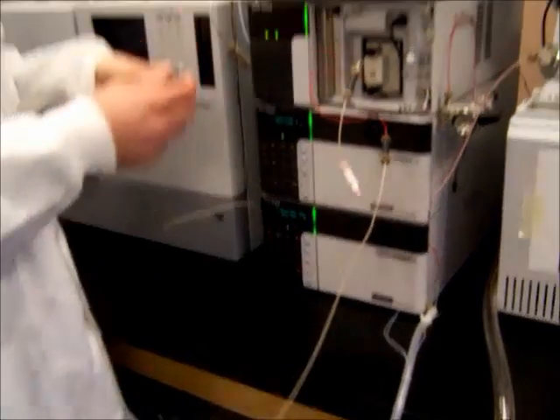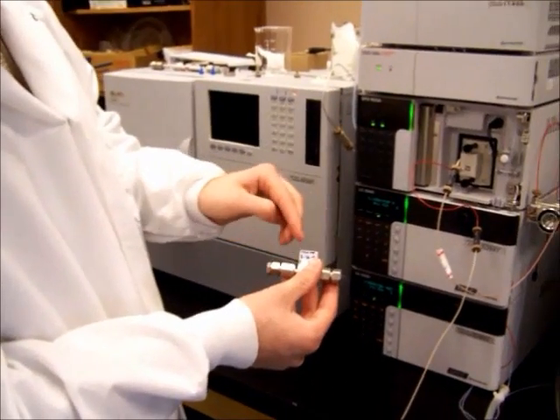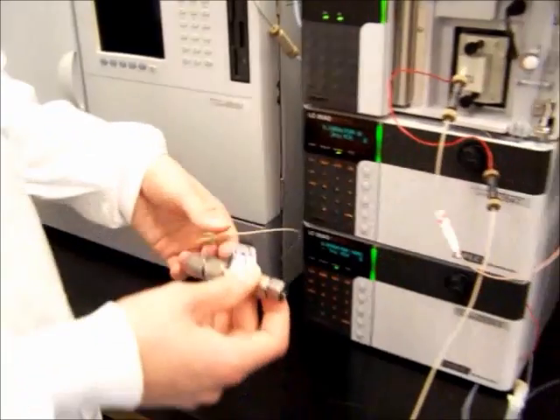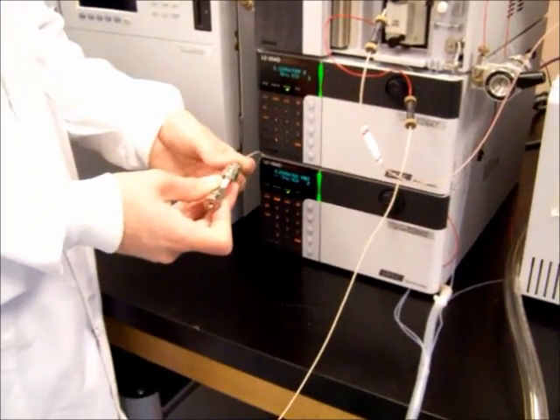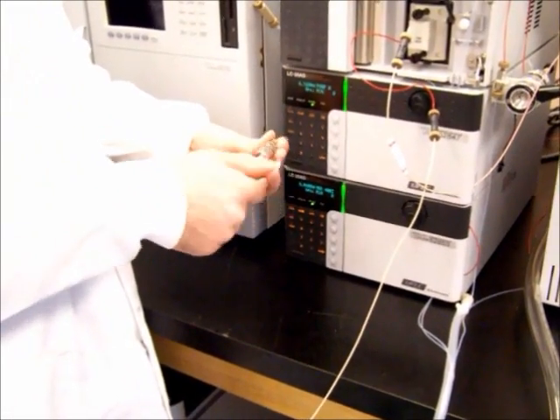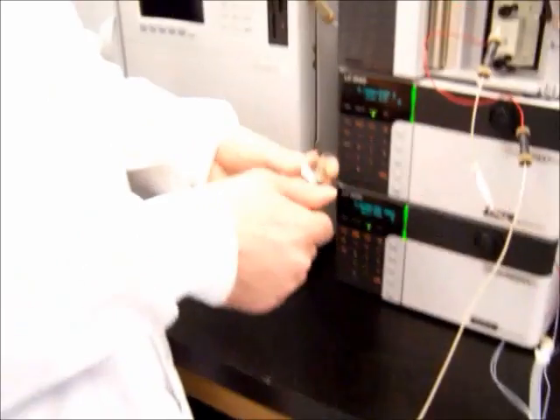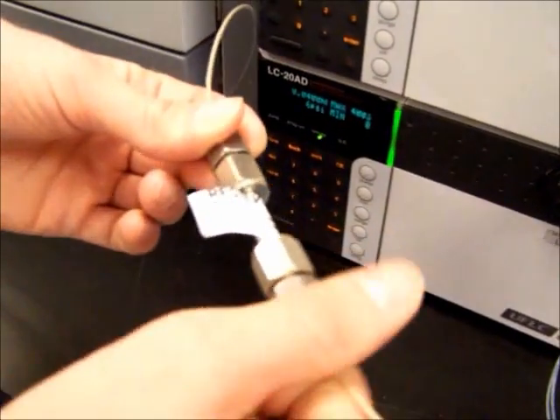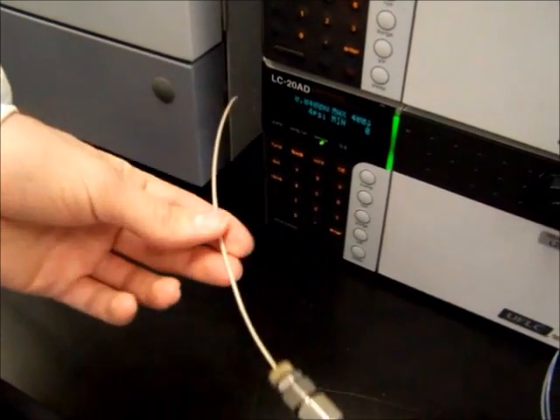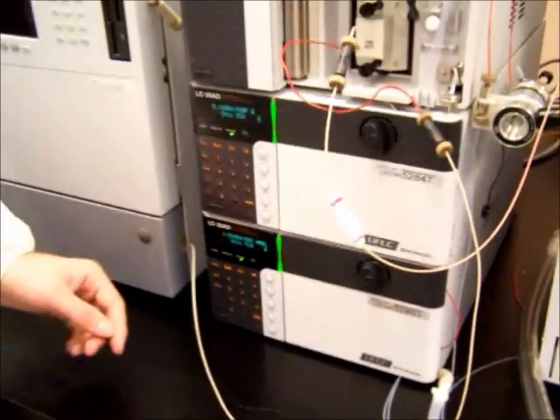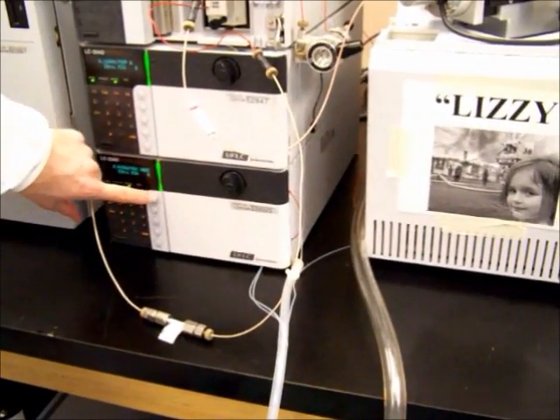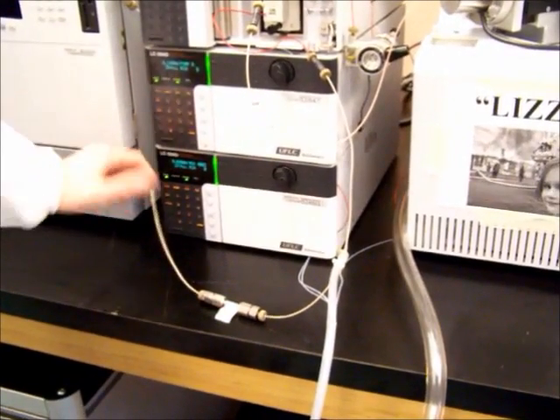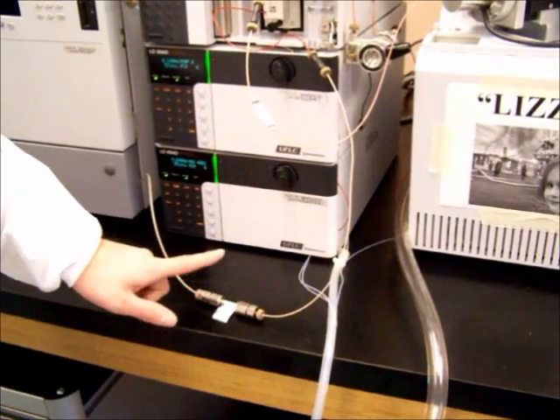Take your column, make sure it's pointed in the right direction, in the direction of flow. All columns will have some sort of an arrow on them, because the flow is only one way through the column. Screw it onto the tubing like this. Turn on the pumps. The pumps need to run for about a half an hour with fluid and solvent traveling through the pumps to equilibrate the columns.